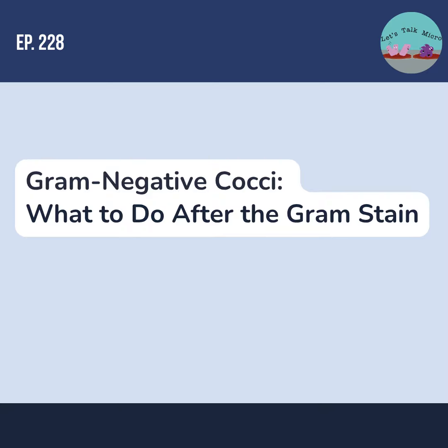And something that I found to be useful, and it's always good, as I said, to learn the components of your media. But in the lab, sometimes we have Myroides and Proteus together. And it's very hard to isolate the Myroides because the Proteus keeps swarming. So one thing that might help you is to sub that suspect colony to a modified Thayer-Martin, incubate it, and maybe after 10 hours or so, when you see growth, sub it to another medium. You might keep the Proteus, you might hold it back long enough for you to get that Myroides out.